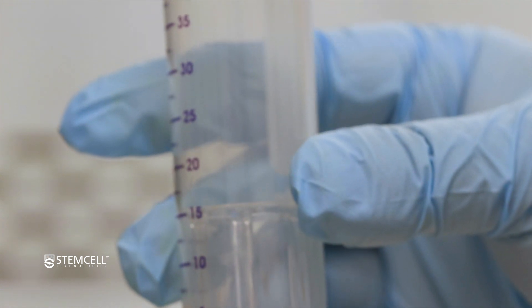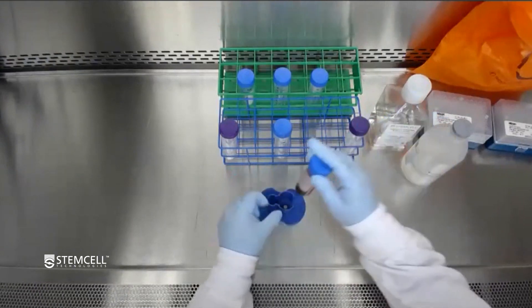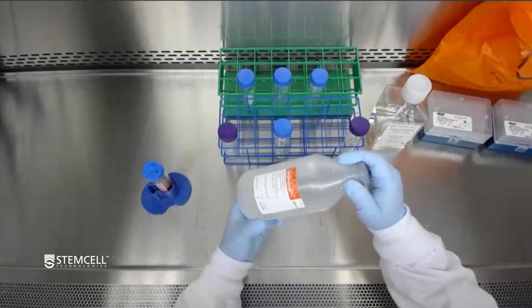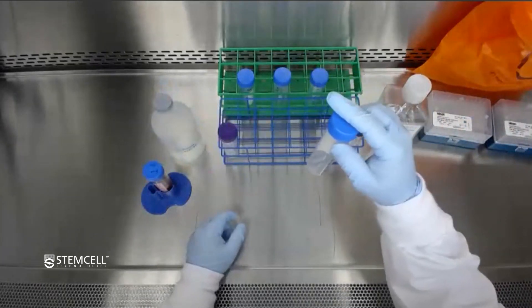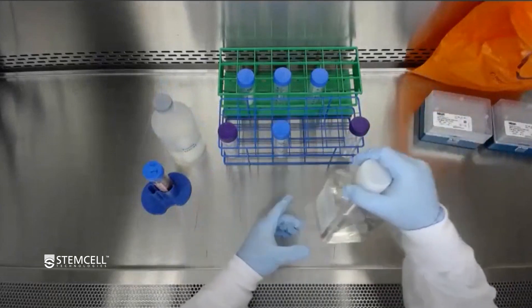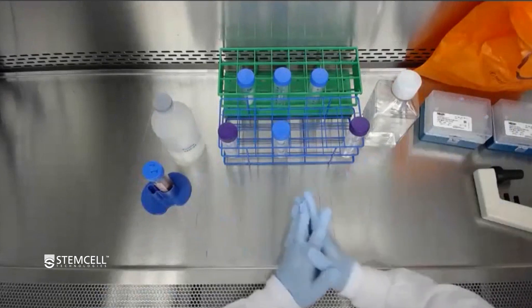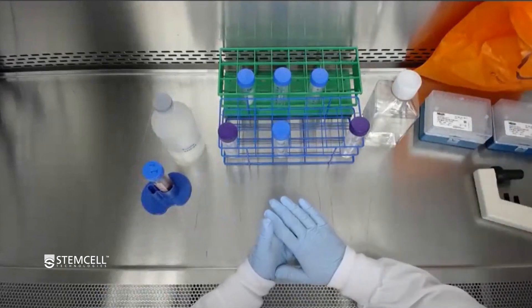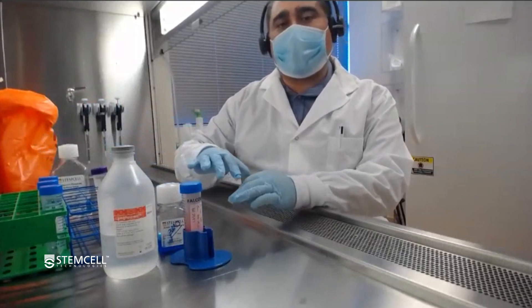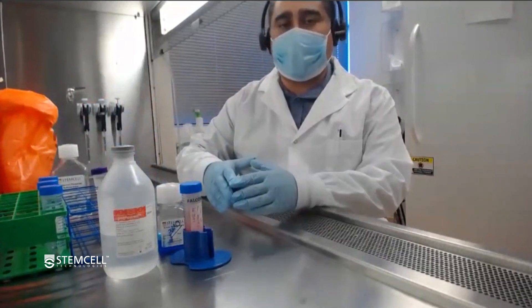To perform a CEPMATE density spin, what you will need is peripheral whole blood, a CEPMATE tube, density media such as lymphoprep or FICOL, an empty tube to dispense your blood and dilute it with PBS and 2% FBS, serological pipettes, pipette aids, tips for counting, and liquid waste and a waste bag. An important consideration is to make sure all your reagents are at room temperature and that your centrifuge is also at room temperature, because cold conditions will impede the density spin.